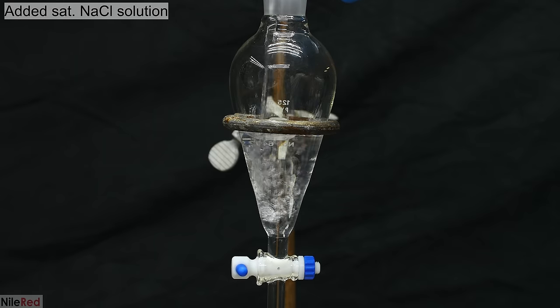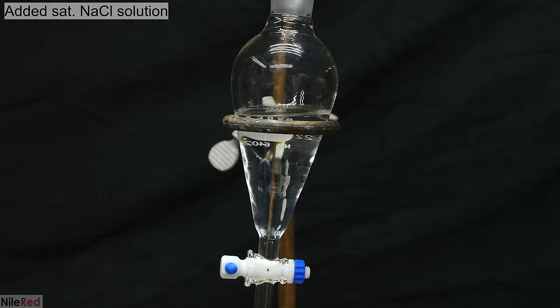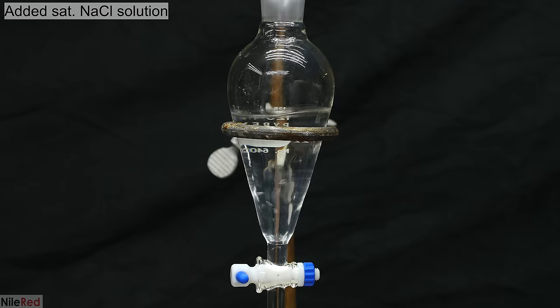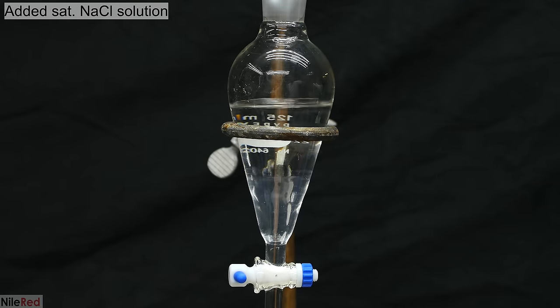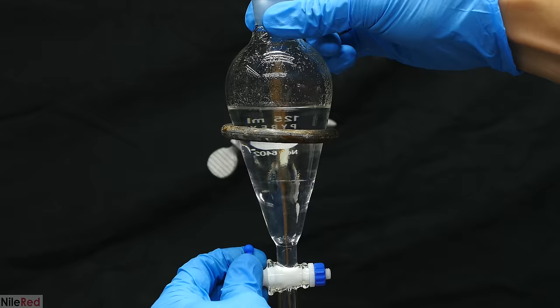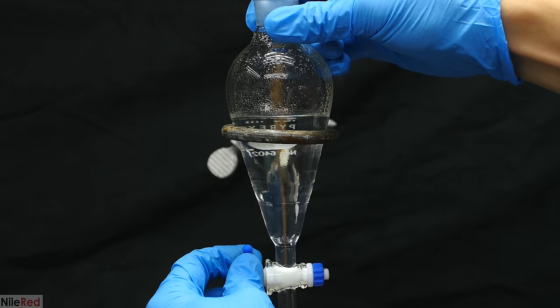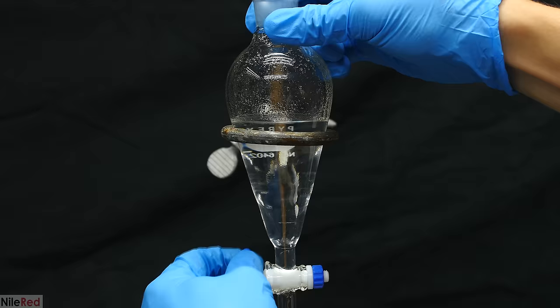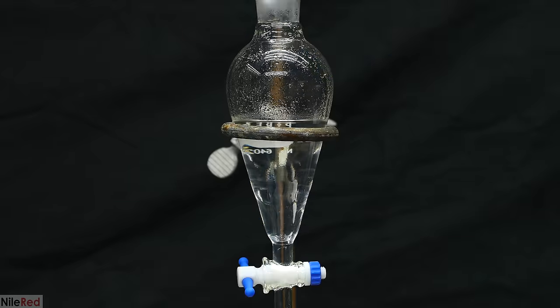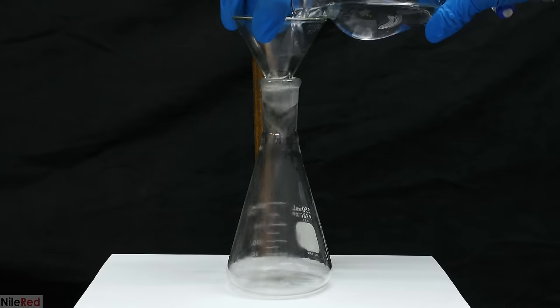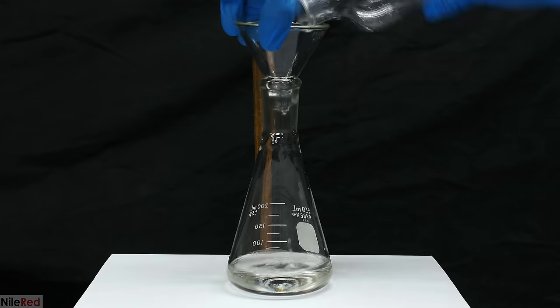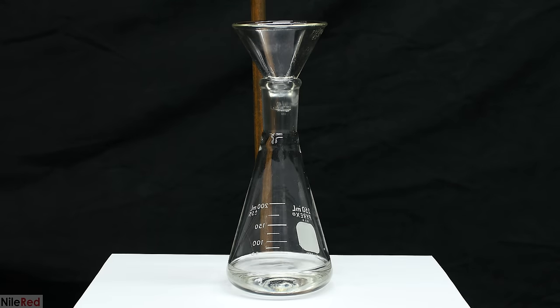The combined ether washings are poured back into a clean separatory funnel, and then I pour in some saturated salt solution. This step is somewhat optional, and it's mostly just used to dry the ether and pull out any water that might be dissolved in it. The aqueous layer was drained off, and our upper ether layer was poured into an Erlenmeyer flask.